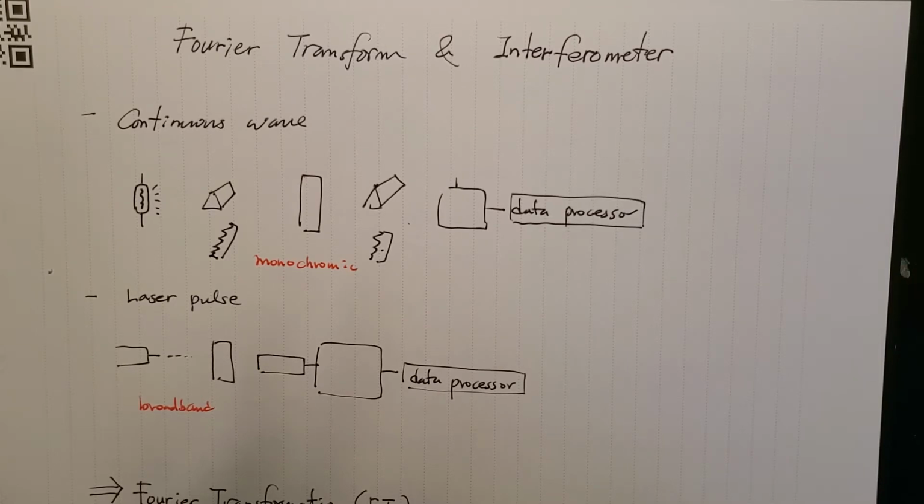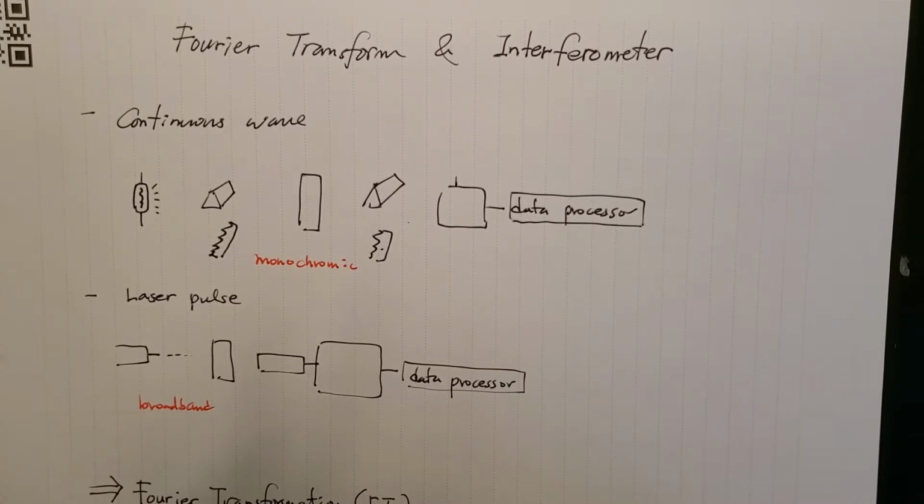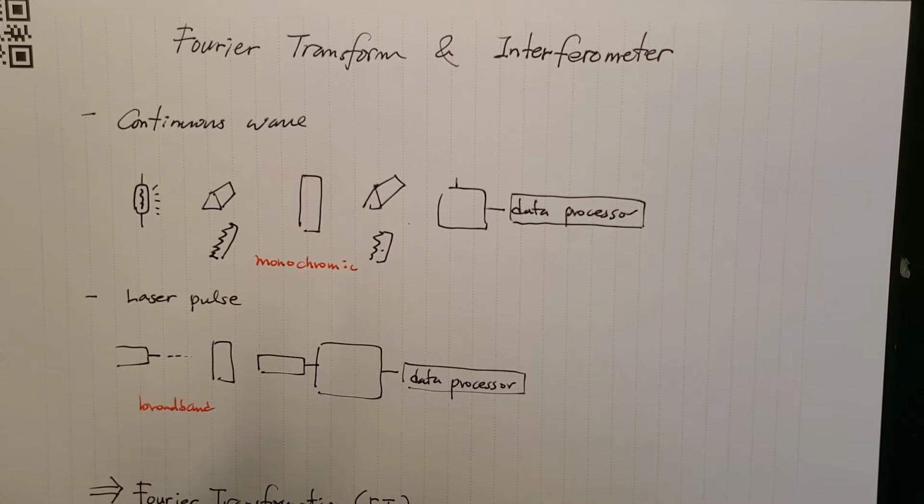It takes much less time, and also because we can repeat the experiment multiple times in fractions of seconds, we can do thousands of experiments in such a short time. Therefore, we can improve the signal to noise ratio. Therefore, that allows us to work with a very diluted sample and very small amount of sample.